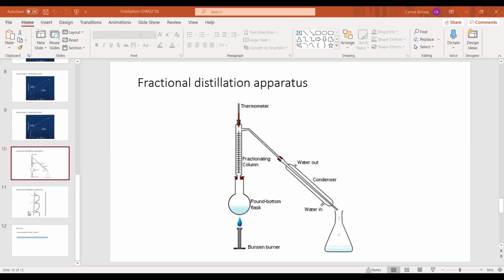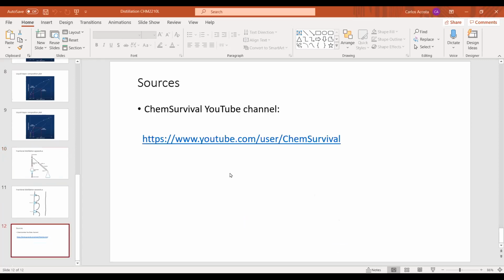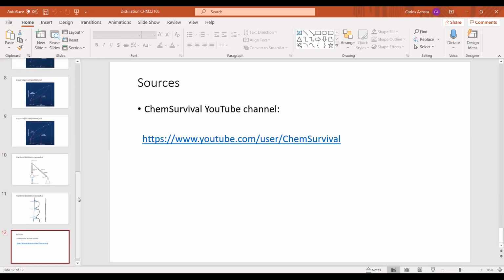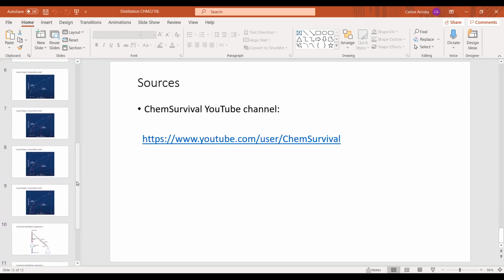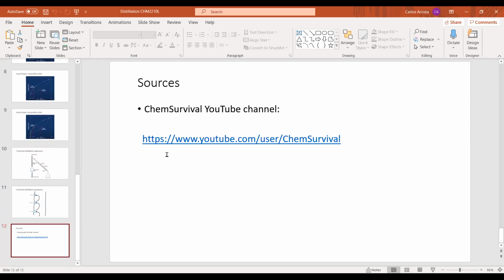Now, this is pretty much the end of the lecture, but I do have to share my sources. I took a lot of this material from this YouTube channel called Chem Survival. They do an amazing job of explaining both simple and fractional distillation. I highly recommend you watch these videos because they explain it better than I do. I will send these to you as an additional resource with the video that you need to watch for the lab. You don't have to watch them, but they are great. They do other lab techniques as well, and they do a really good job. So I would watch them.